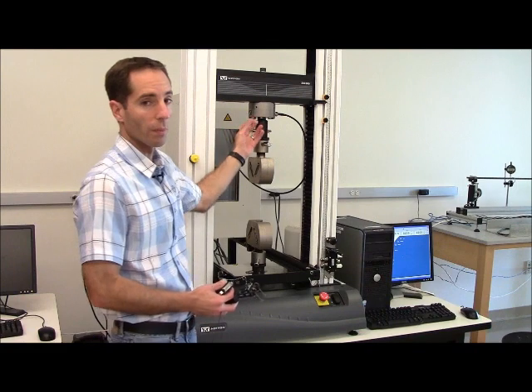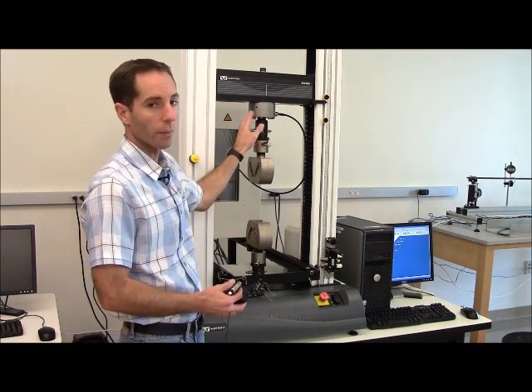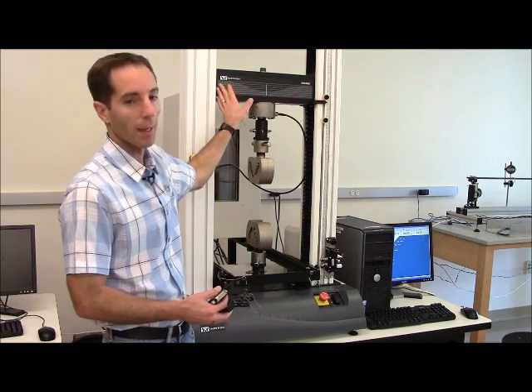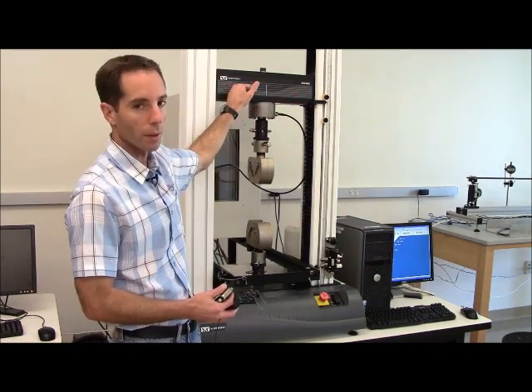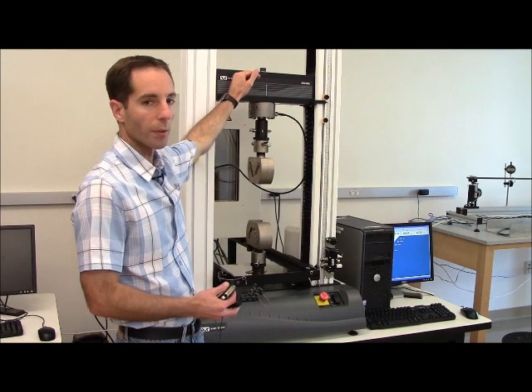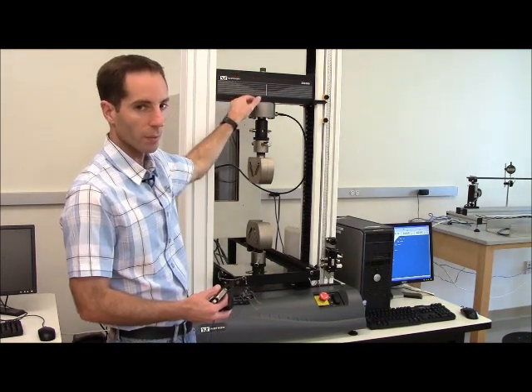By the way, these load cells are capable of both tension and compression, so they can read both values. We have the cross member here that is the part that actually moves, so if we're doing tension, this is moving up to pull the sample apart. In compression, it's moving down.